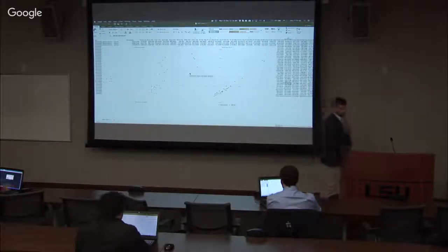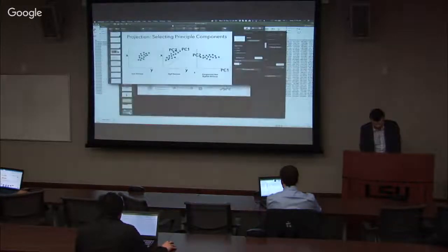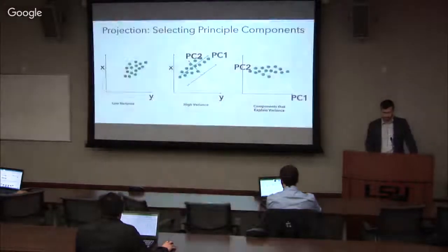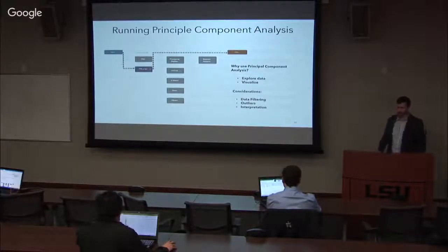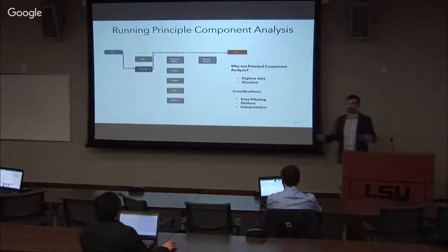Okay, so now that we prepared our data, what can we do with it? One of the things that we talked about is PCA, how we can explore our data. But it doesn't actually give us too much information beyond visually seeing some major trends in the data, right? It doesn't give us a lot of detail.